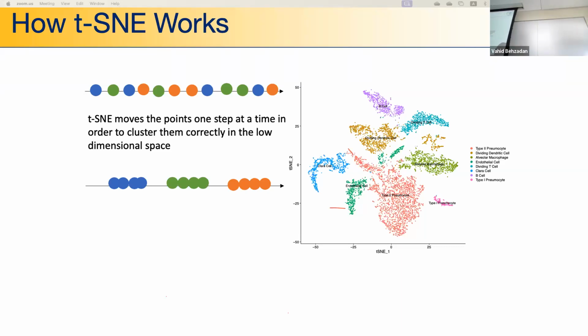But you have the same group of cells for patients and for normal subjects. And then you compare the pneumocytes between normal and disease. So you're looking for the differential gene expression for a specific group of cells between two conditions.